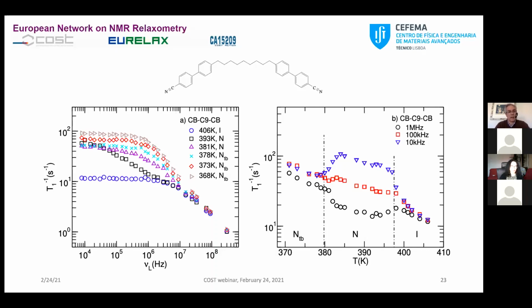So another contact point is a direct measurement of the diffusion coefficient. It is very important to have it. If you have it, it's better than not having it, because for a complex system, it helps you to limit, or to discriminate, the influence of the diffusion mechanism contribution to the overall relaxation rate. If you don't have it, you have some freedom to play with it, but it cannot be completely different from other systems which are similar to this one.